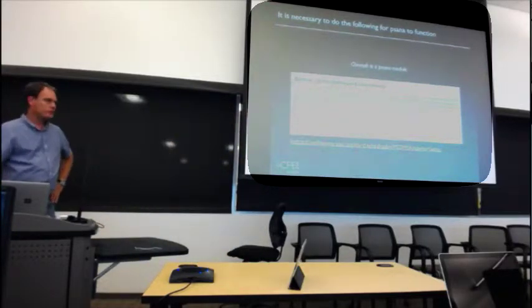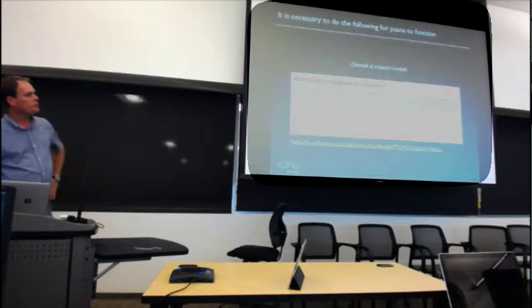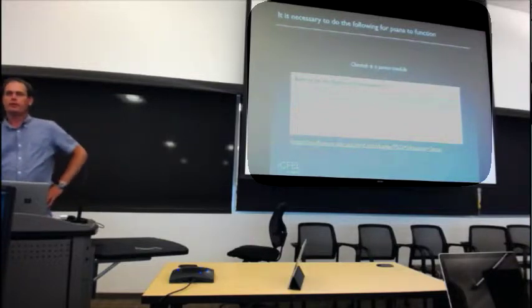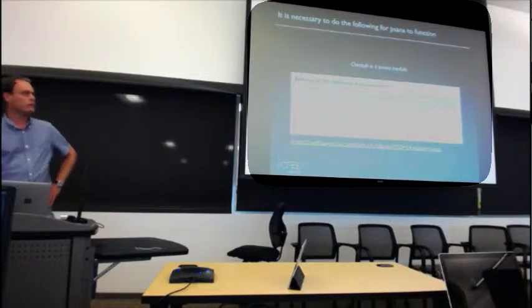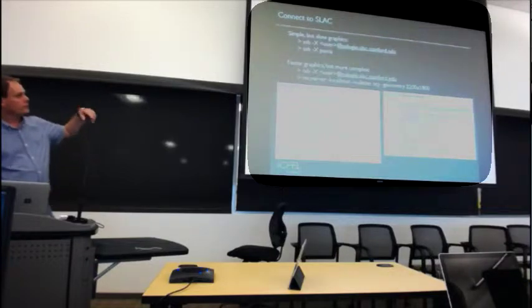So then there was the question of what to do for the tutorial here, and I am going to take a couple of minutes just to whisk you through what I think you'd want to do here. The idea was to give you a template and something to start with that you can get up and running fairly quickly. And then based on that, most people looking at the templates will be able to figure out what to change for their own experiments pretty quickly, rather than going through the tedious steps. So no need to write this down. I'll go back over these steps.